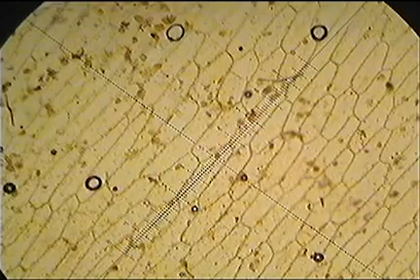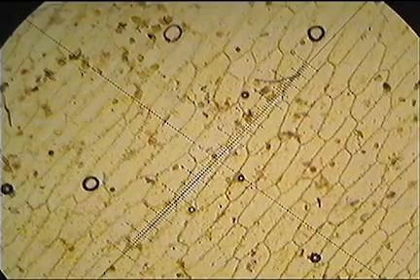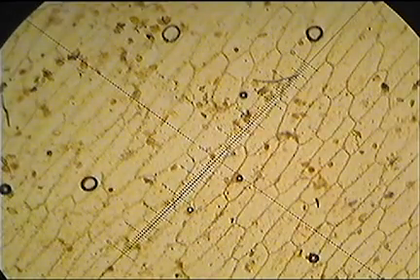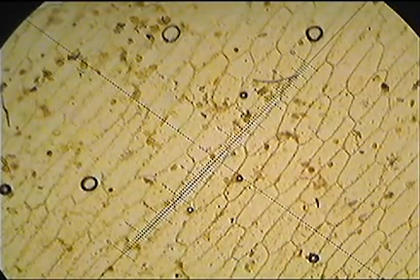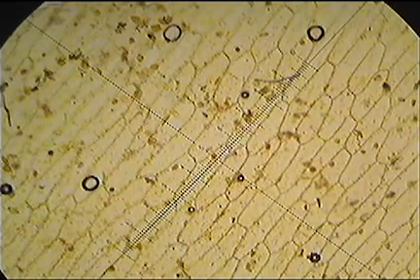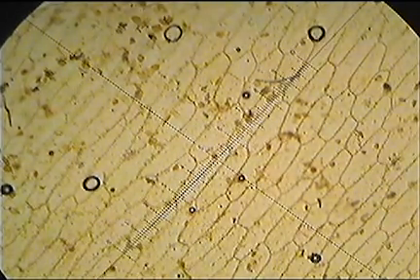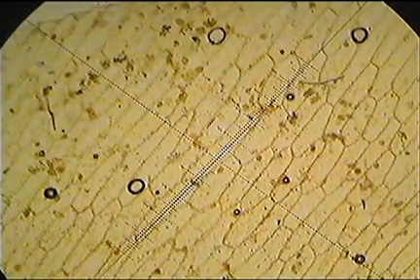So I've lined one up, looking at the cell just in the middle underneath the scale. You'll notice that rather than rotating the slide, it's much easier just to rotate the eyepiece. So I've rotated that scale so it's sitting diagonally. Lining up the cell in the middle there, from the 3 to the 4, 5, 6, that's 1, 2, 3 eyepiece graticule units, and it's exactly 3. So we would just take 3 times 0.099, which rounded is basically 0.30 millimeters across.